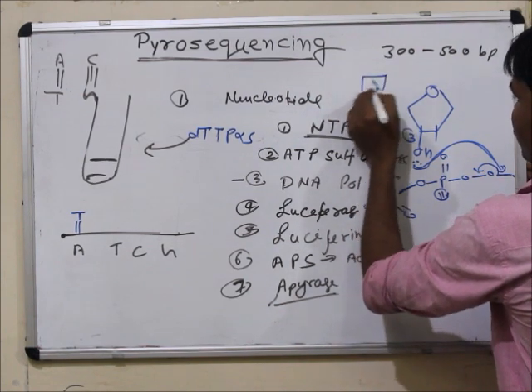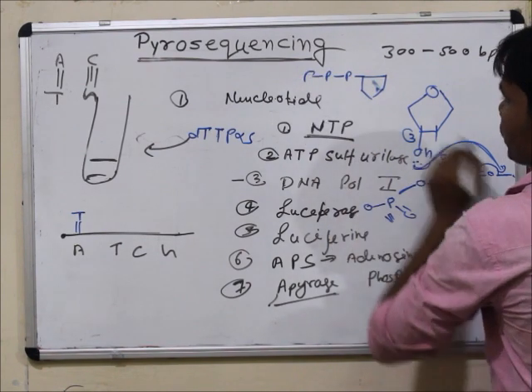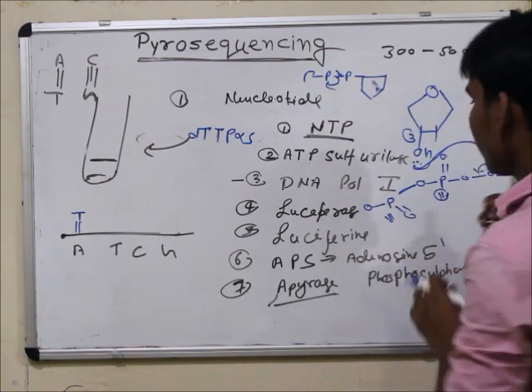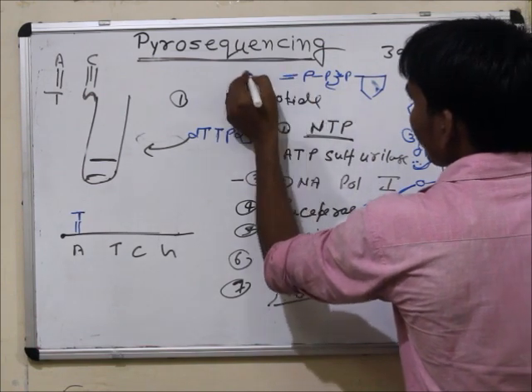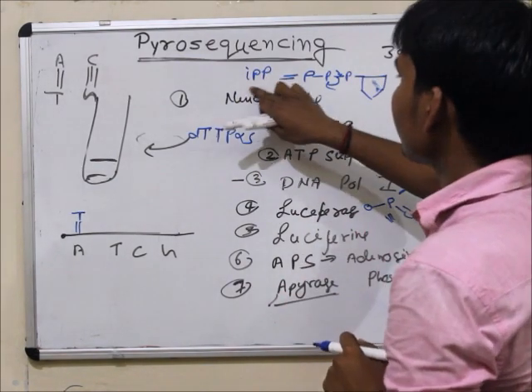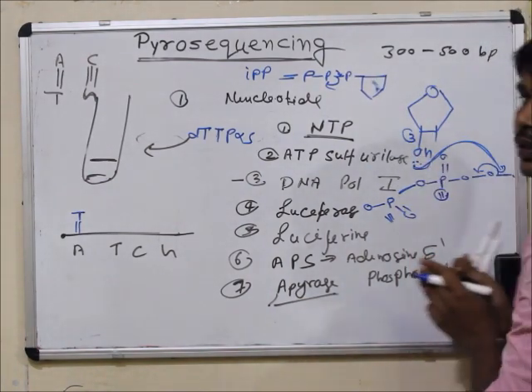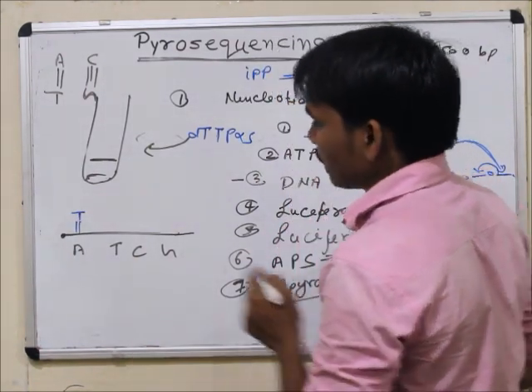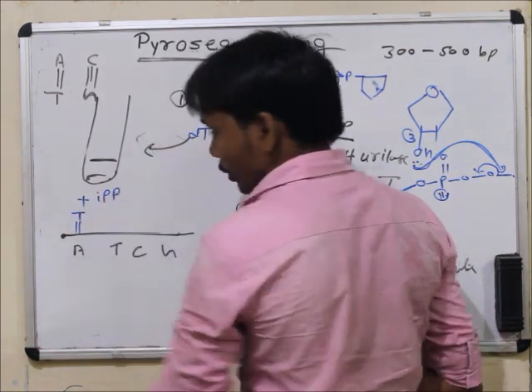In the nucleotide there are 3 phosphates. So this attack was on that phosphate. This will release, in the form of inorganic pyrophosphates. This will be released as inorganic pyrophosphates if the correct base pair is added in position A; T binds, then inorganic pyrophosphates would be released.